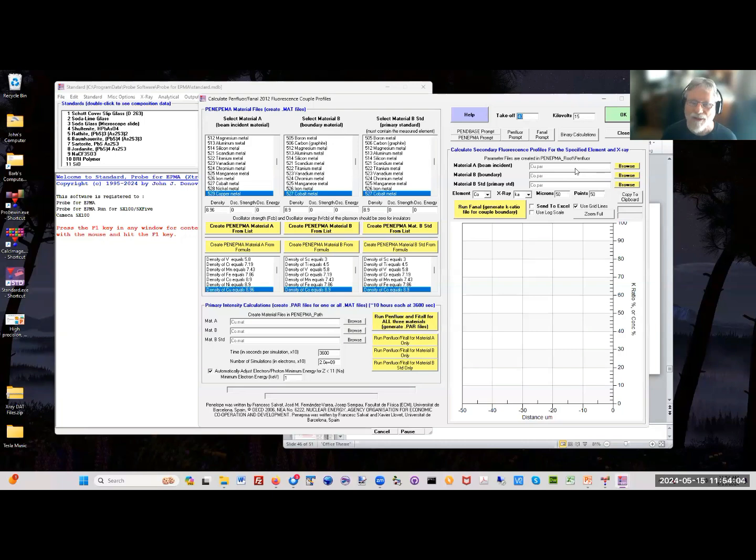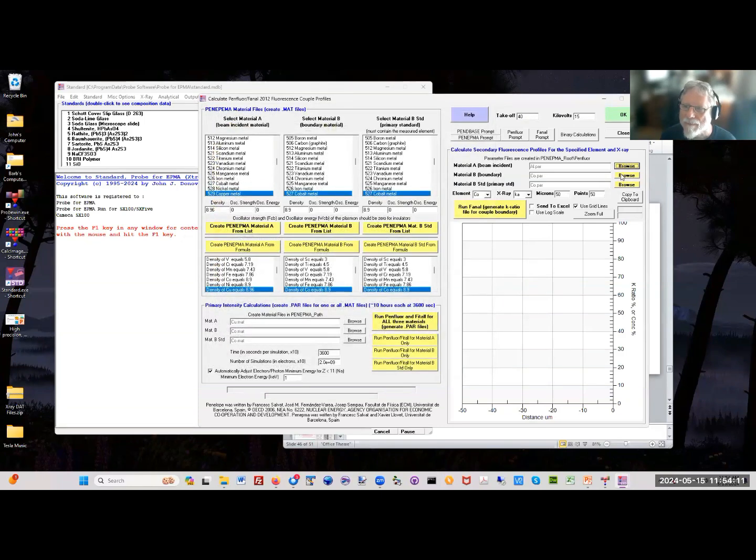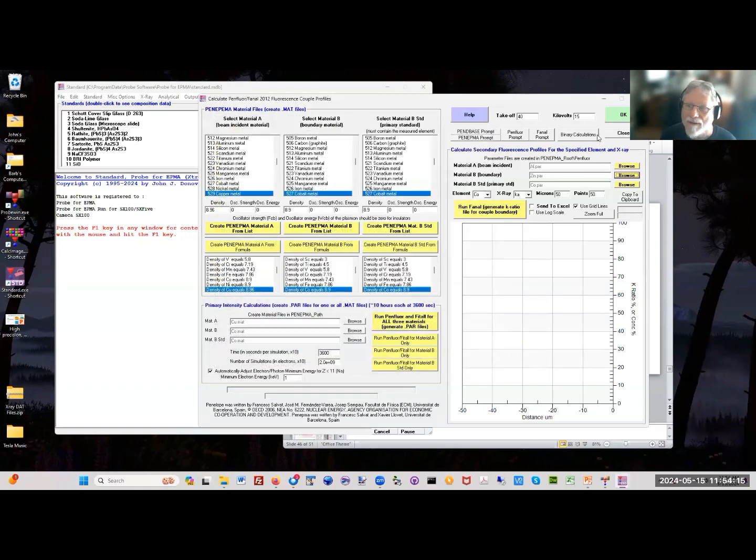So I'm going to do something that a national lab approached me about a few years ago, that they had a problem. And I apologize for being so far over.